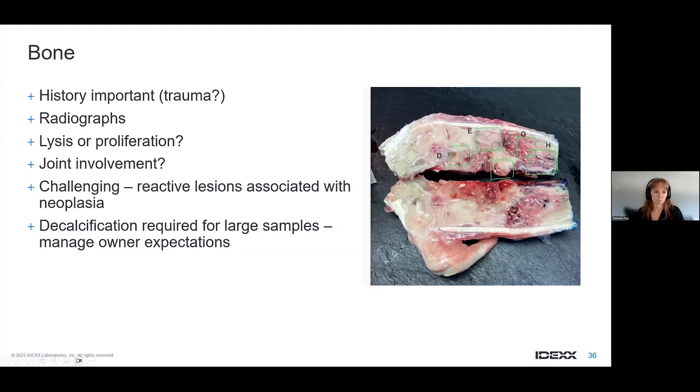Again, as I said before, especially if it's a large sample, the decalcification step might take a bit longer. So that's just something to keep in mind. You are not going to get the report for a large bone sample within 3 to 4 days. It will definitely be longer, up to 14 days. Sometimes even longer, but if it's longer, you will get a message from our lab support team that it might take a bit longer.